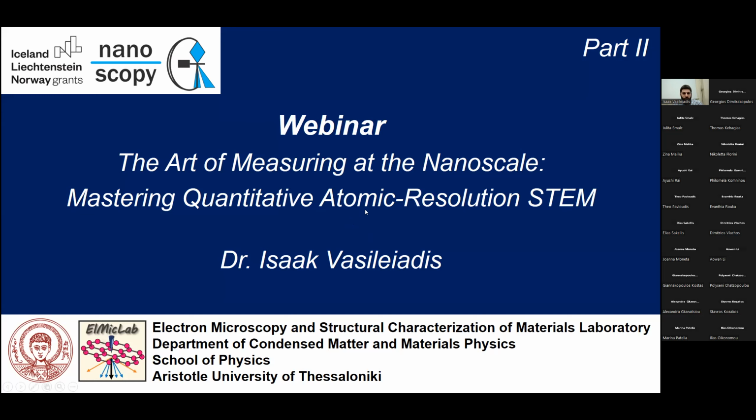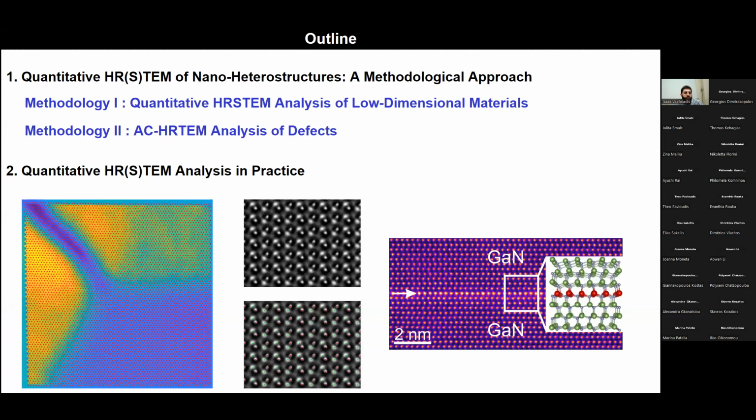Okay. Hello, everyone. I will try to show you in this second part of this webinar how you can employ this integrated methodology to analyze a special nanostructure. This talk has two sections. The first one is how to apply this methodology in real cases. Actually, the first one is about the quantitative high-resolution STEM analysis of low-dimensional materials. And the second methodology is about analyzing structural defects with aberration-corrected high-resolution TEM.